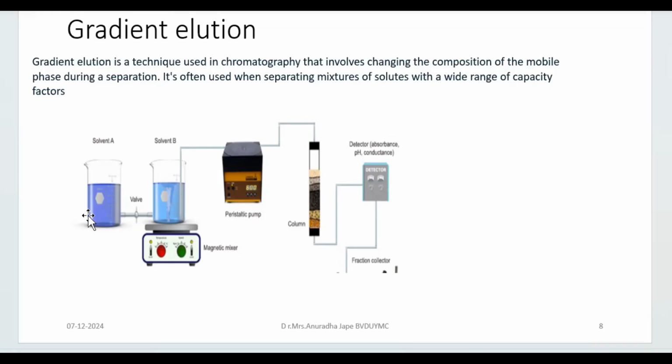During the elution process, it is essential that the flow of the mobile phase is pre-decided and is to be maintained. It should be at a stable rate. Generally, as I said earlier, it is achieved by gravity. So gravity is not going to change, and the effect of gravity on an individual particle is going to be dependent on characteristics of the particle. So the flow rate also is not going to change. But of course, this flow rate can be regulated or changed by adjusting the operating pressure.